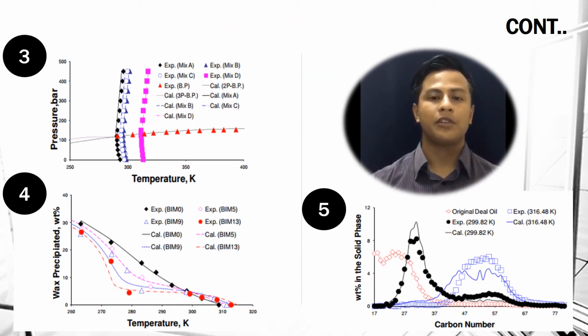From what has been stated by Zhou and Zhang in their article, they have developed a model to predict wax appearance temperature based on oil composition that has been given by HTGC. In this case, we highlight three parameters in improving the distribution of paraffin that have been mentioned above.